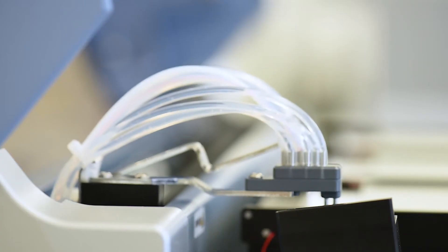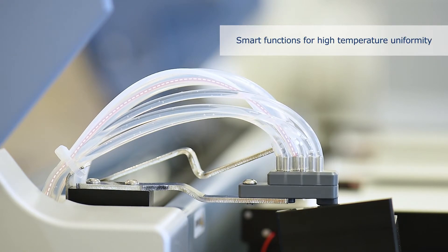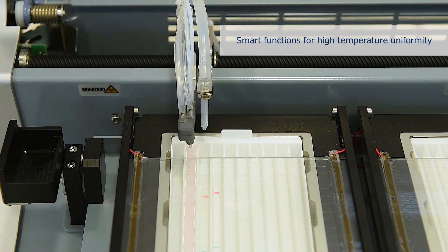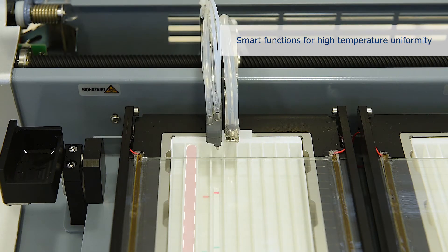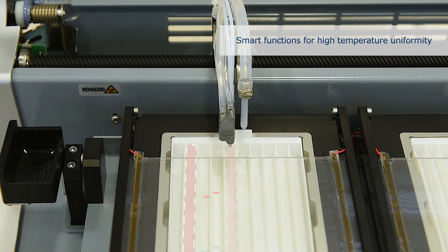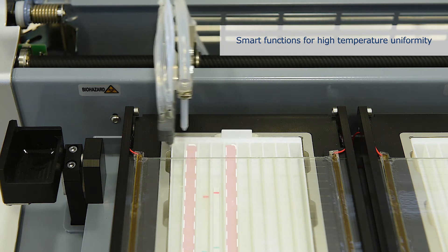Moreover, Dynebolt Heat includes several smart functions for achieving very high temperature uniformity, like preheating of dispensing tube or preheating of lateral strip tray wall. Therefore, it's minimizing the differences between middle and lateral strips.